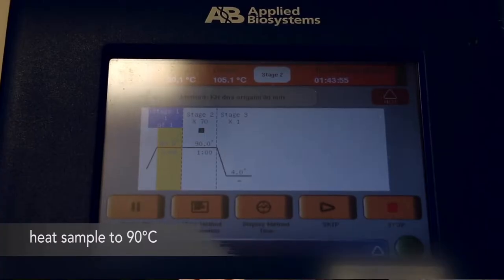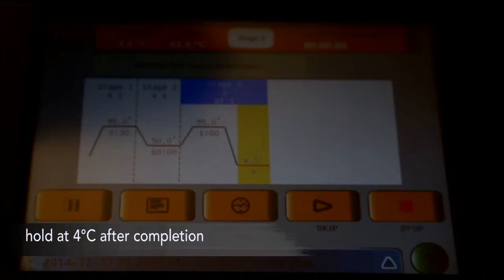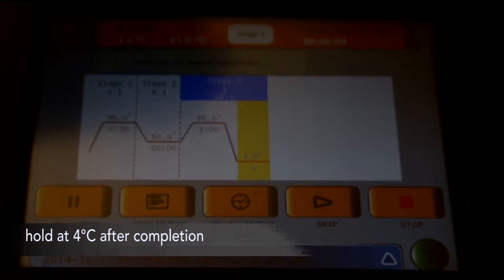Heat the sample to 90 degrees C. Then cool the sample at 1 degree C per minute until it reaches 20 degrees C. If non-thermostable custom-functionalized oligos are being used, these oligos should not be added to the mixture until after the mixture has reached a temperature compatible with the functionalized oligos. For your convenience, you may want to set the thermocycler to hold at 4 degrees C after completion.